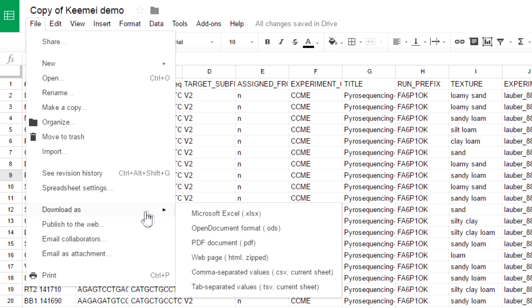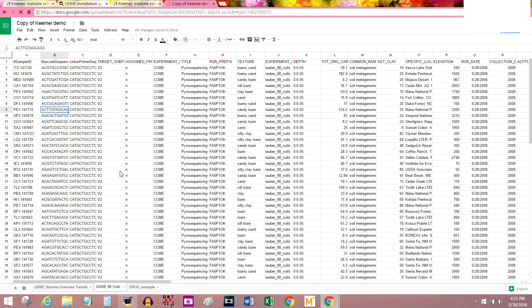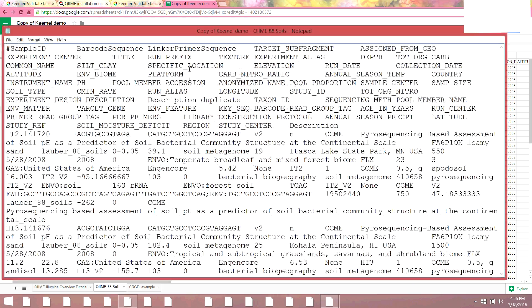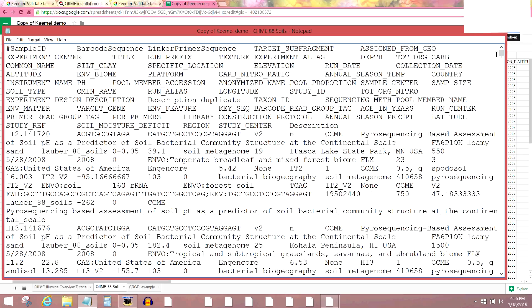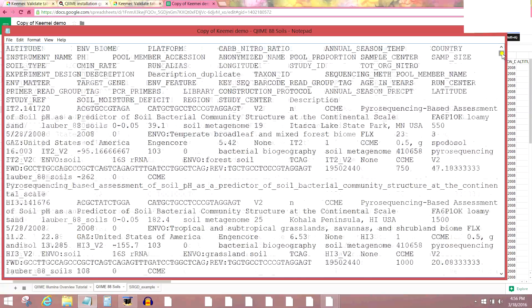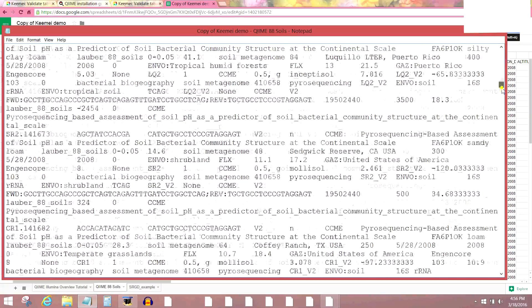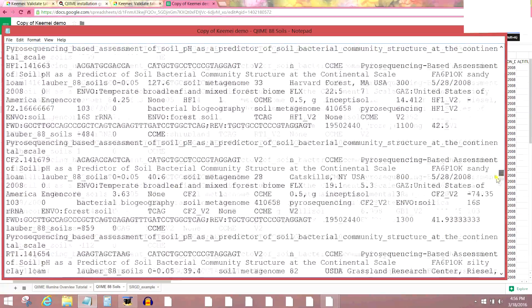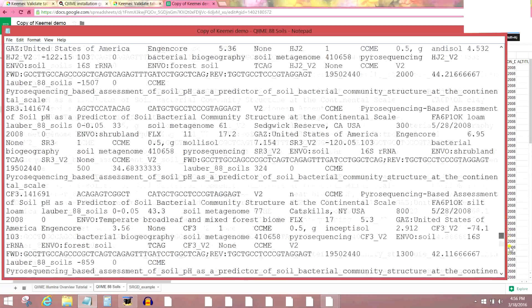File, Download As, Tab Separated Values. I'm going to open it. Wow. And this is what it's going to end up looking like. A lot of information.